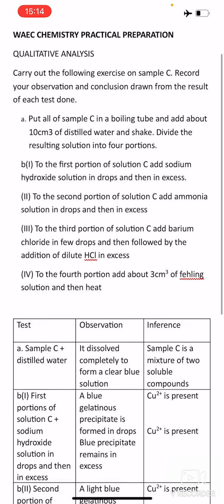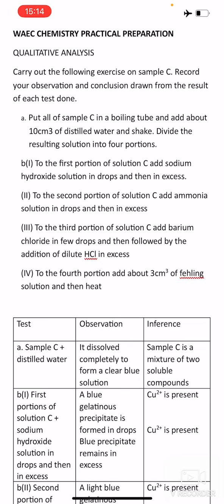So look at the question that I formulated. To carry out the following exercises on sample C. And on Tuesday, the sample C that you will be given is copper(II) sulfate and glucose. Copper(II) sulfate and glucose, that's CuSO4 and glucose. And let me first talk about them.